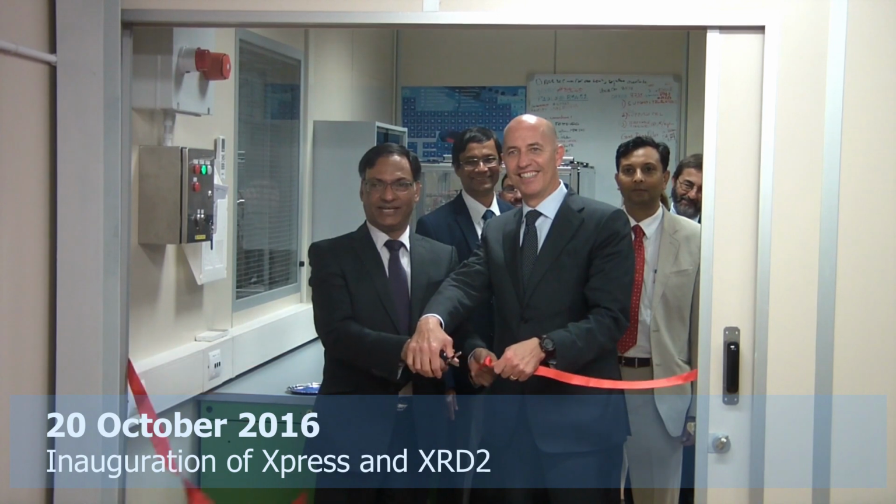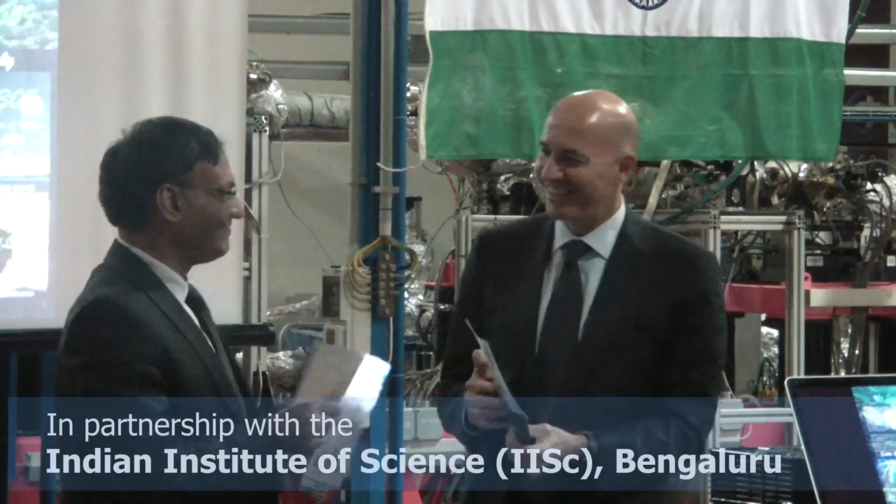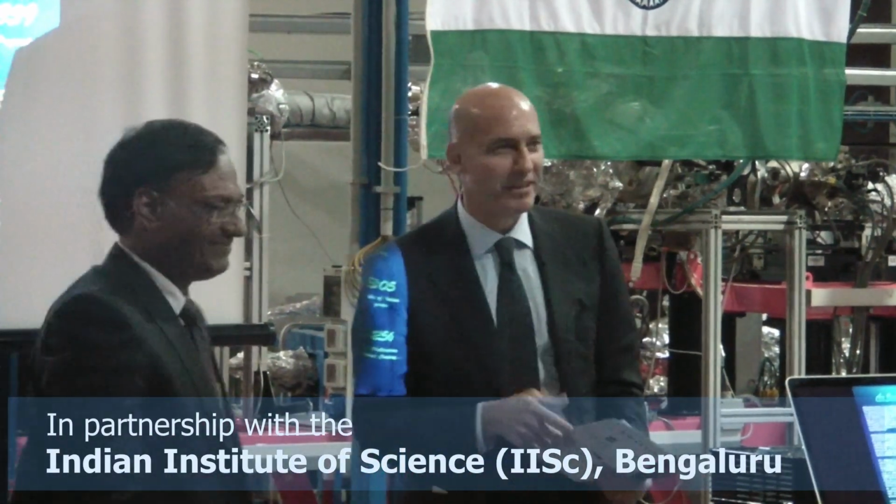This Beamline was originally constructed by the team that is operating XRD1, so people that were already very knowledgeable about everything that is important for this Beamline to function correctly. This Beamline is a partnership with the Indian scientific community, and it's administered by both Elettra and the Indian consortium. We are a Beamline dedicated to protein crystallography, or macromolecular crystallography.